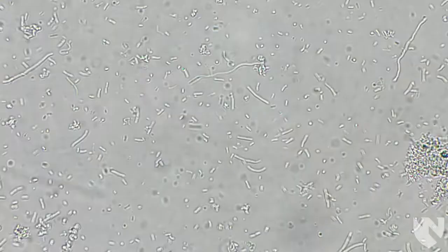While on this objective, we will quantitate any other elements we see, such as red blood cells, white blood cells, crystals, bacteria, etc.